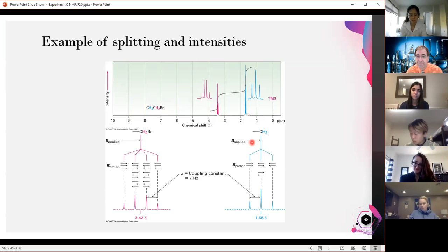Okay, some of that makes sense. Some of it just comes. NMR is one of those things. Think back to when you first started with Lewis structures, they were really hard, right? Because you're like, wait, what do I connect to what, and how do I do it? And then you just practiced, and it got better. NMR is going to be the same thing. You look at this, there's a lot of information in here, and at first it's too much, but you're going to start to look for patterns. As you play with NMR and do examples, start looking for patterns. It's going to help you out. And I'm going to highlight a couple of these here in just a second.